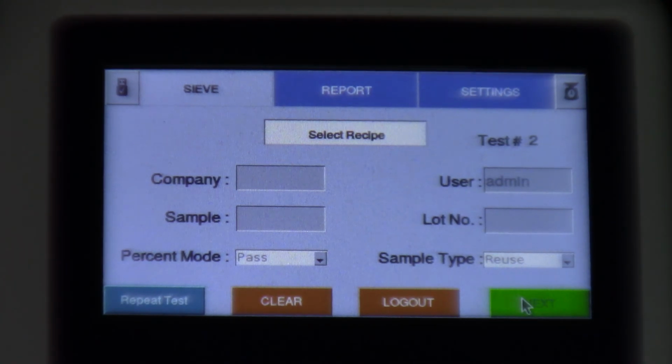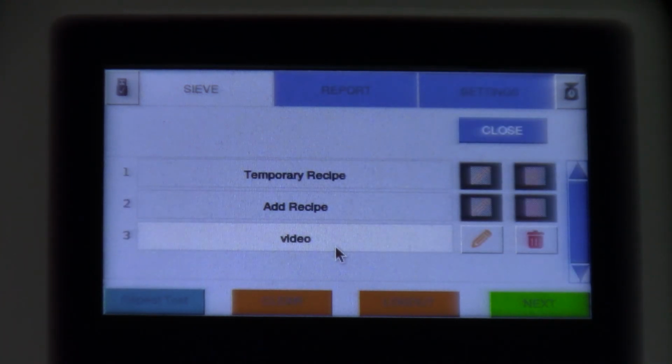And that was the temporary recipe. If you wanted to create the recipe as we did before, then we follow through with the various recipes. So we'll take performing a 2-screen recipe in another segment.